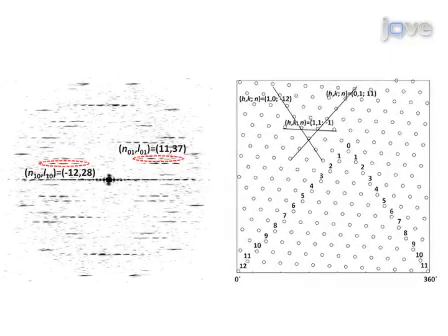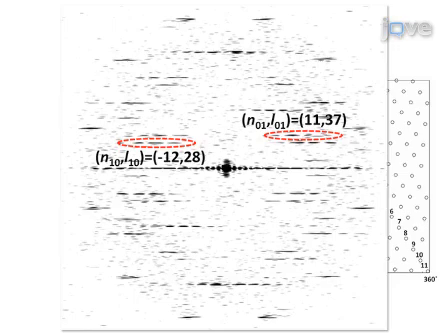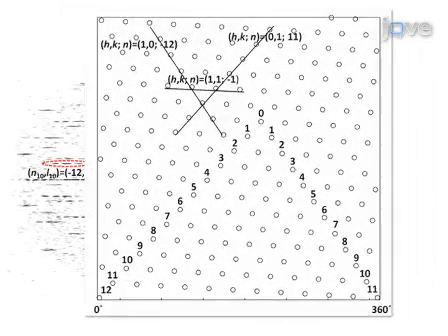A helical object can be indexed by two parameters: the Bessel order, n, and layer line number, L. In the Fourier transform of a helical object's surface lattice, each layer line is characterized by n and L, and corresponds to a set of lines on the surface lattice as denoted by h and k indices.